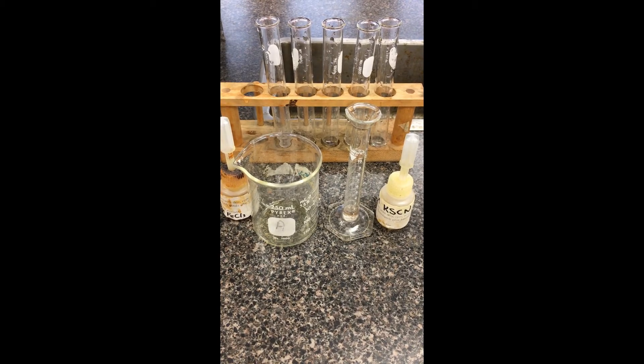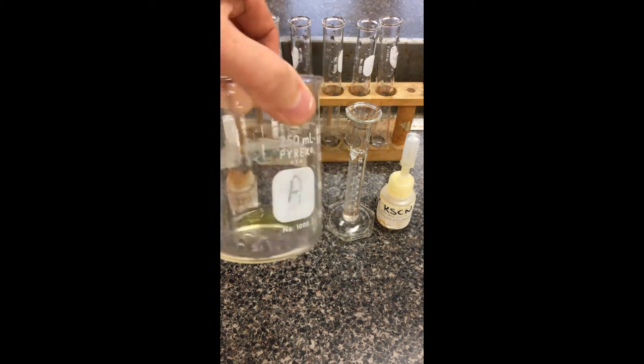For station two of this equilibrium lab, we're going to start off by making our starting solution. We're going to take 0.2 molar iron chloride here. I've measured out one milliliter here into a 250 milliliter beaker.